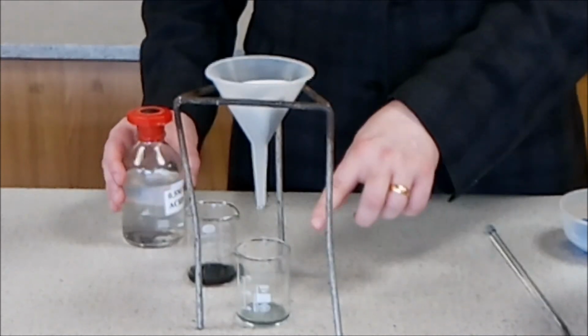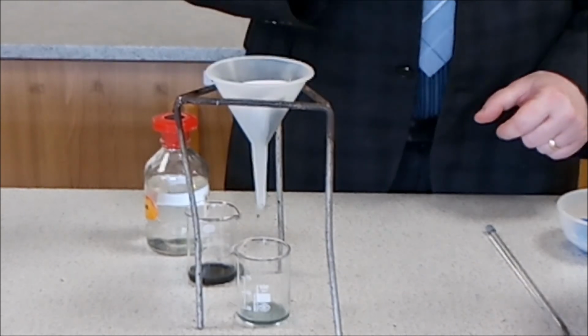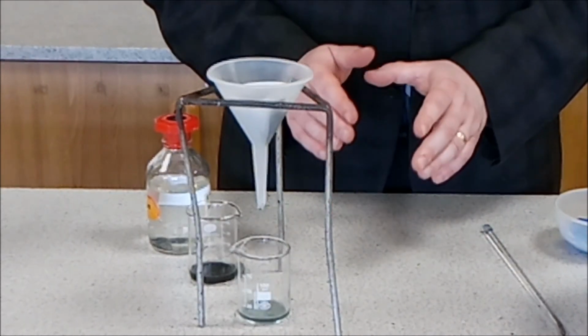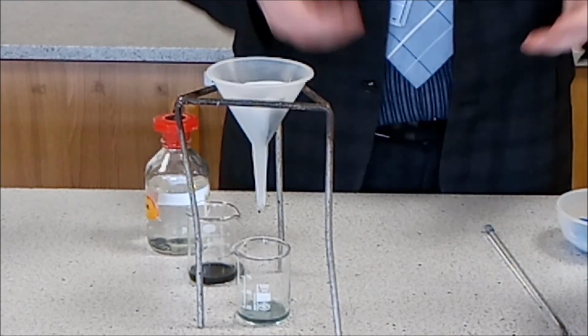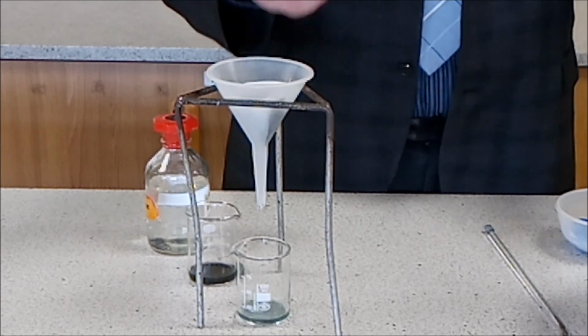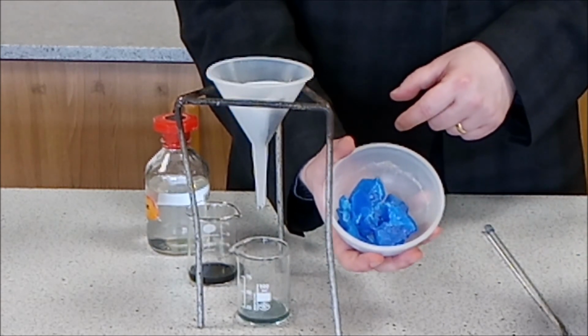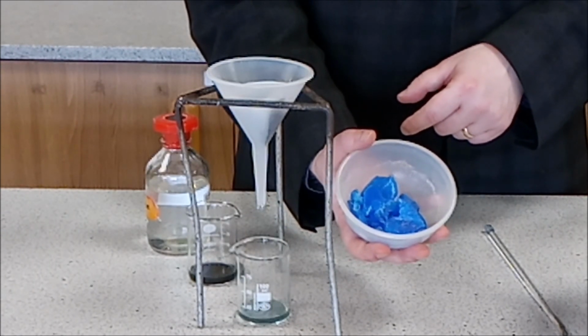Once we have that copper sulphate, we can then evaporate the water off. So evaporating the water off can be done in two ways. We can either boil it off, or we can allow it to evaporate. If you allow it to evaporate, you end up with large copper sulphate crystals that look something like that.